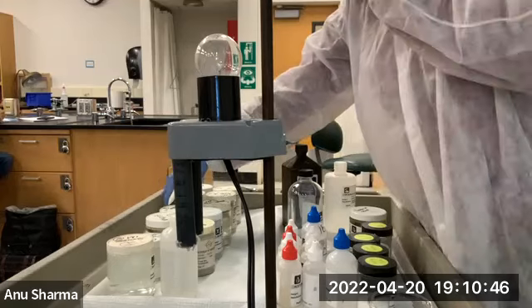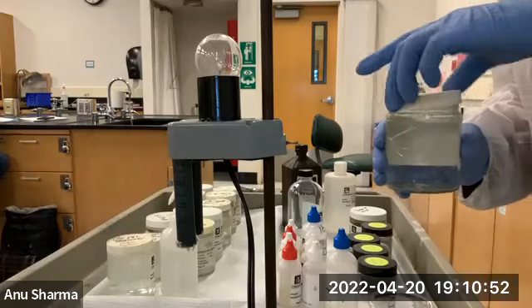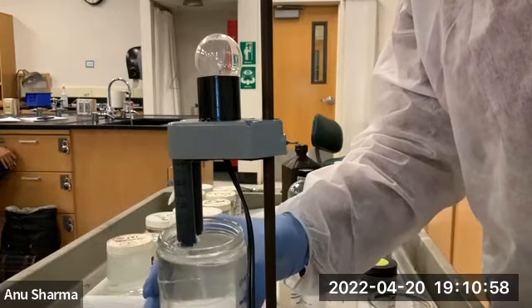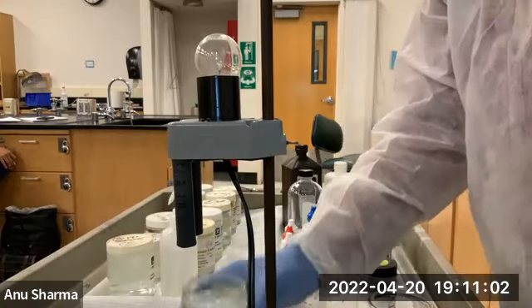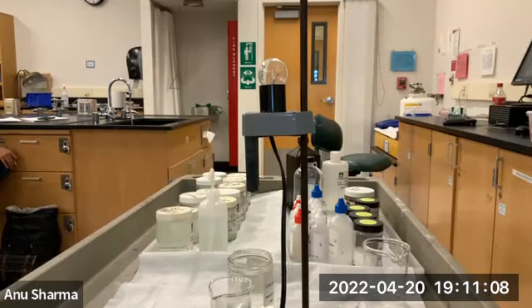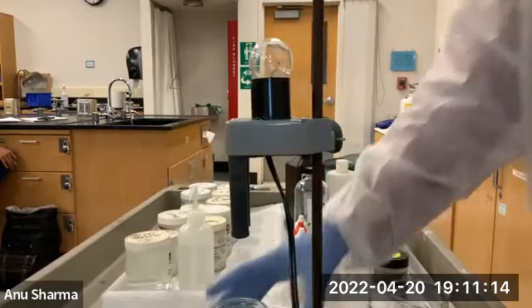Anytime you see the AQ, aqueous, that means it is soluble in water. That means now sodium chloride is dissolved in water, the same white sodium chloride solid. The ions of the solid sodium chloride, sodium ions and the chloride ions, are solvated.